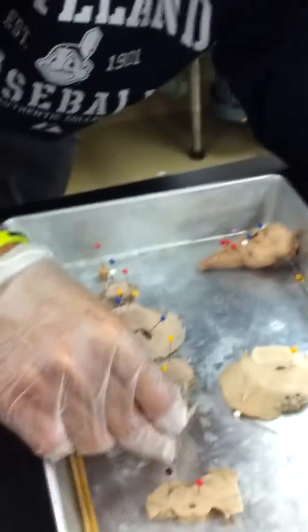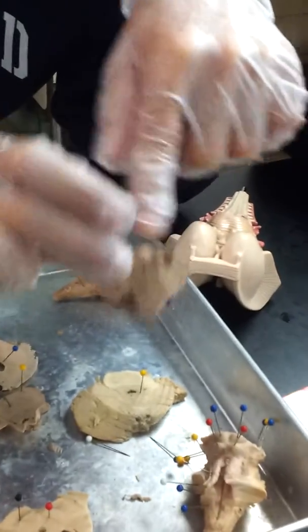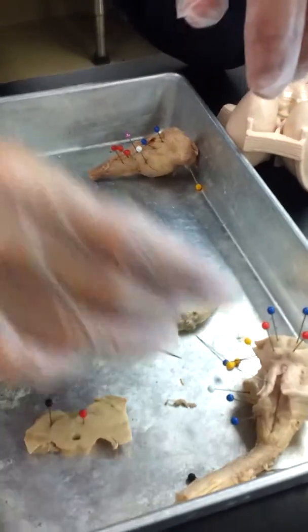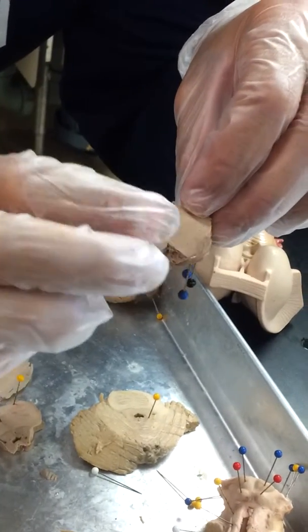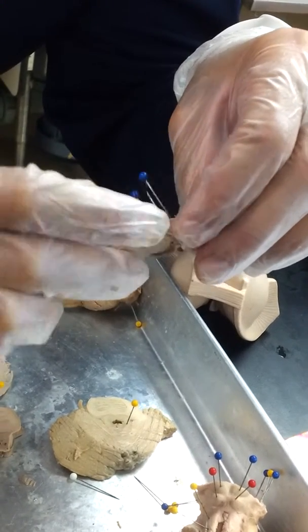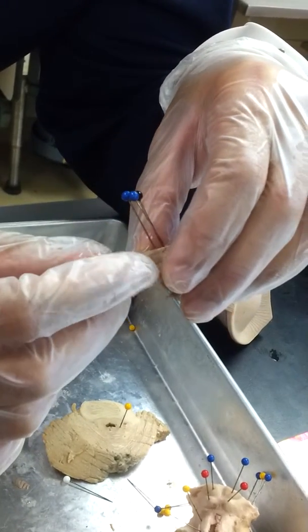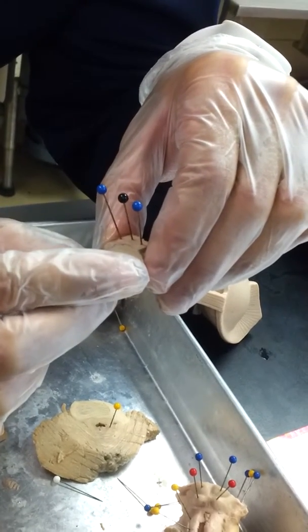Same thing with this. This slice though has both levels. So this is your inferior colliculus here. You see that? It's 2 bumps. Yeah, there's 4 bumps here. This is both slices. This is rostral midbrain. This is caudal midbrain. So this side would be inferior colliculus, and this would be superior. And so whether it's inferior or superior gives it away, whether it's rostral or caudal.